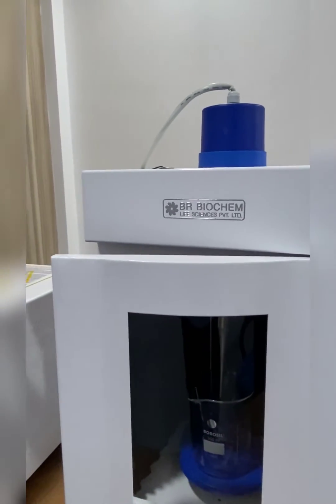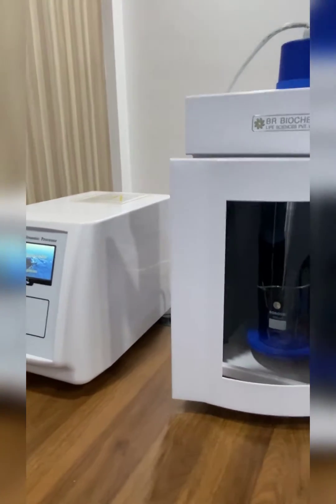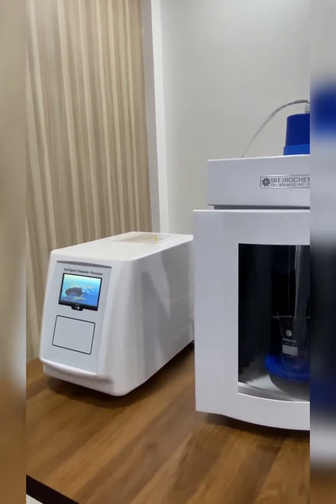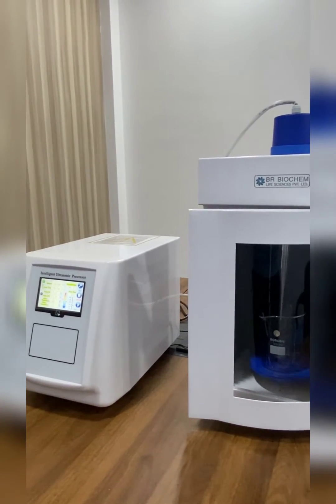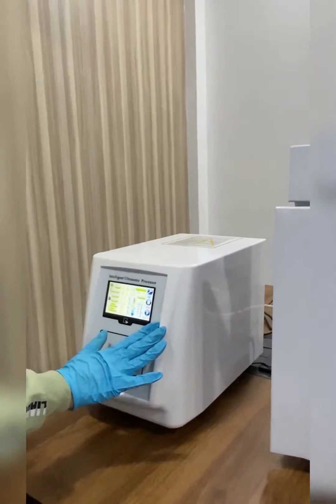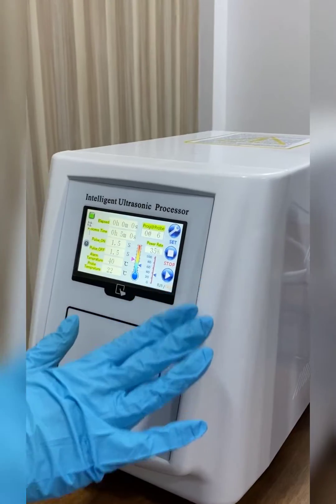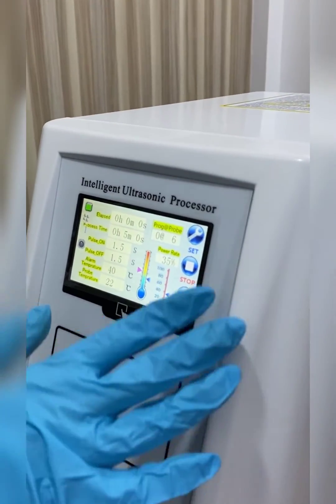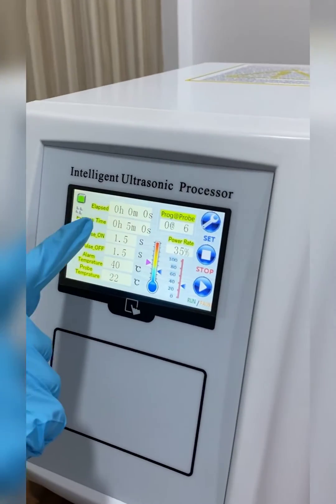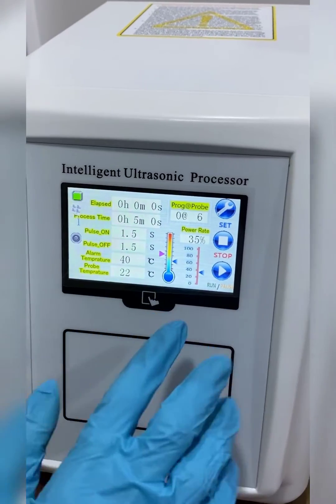Hello everyone, welcome to BR Biochem Life Sciences Private Limited. This is our ultrasonic homogenizer, also called a probe sonicator. The power range of this homogenizer is from 10 watt to 650 watt. This is the touchscreen display with different functions used to operate this ultrasonic homogenizer. You can set the process time, pulse on time, pulse off time, probe temperature, etc., according to your requirements.